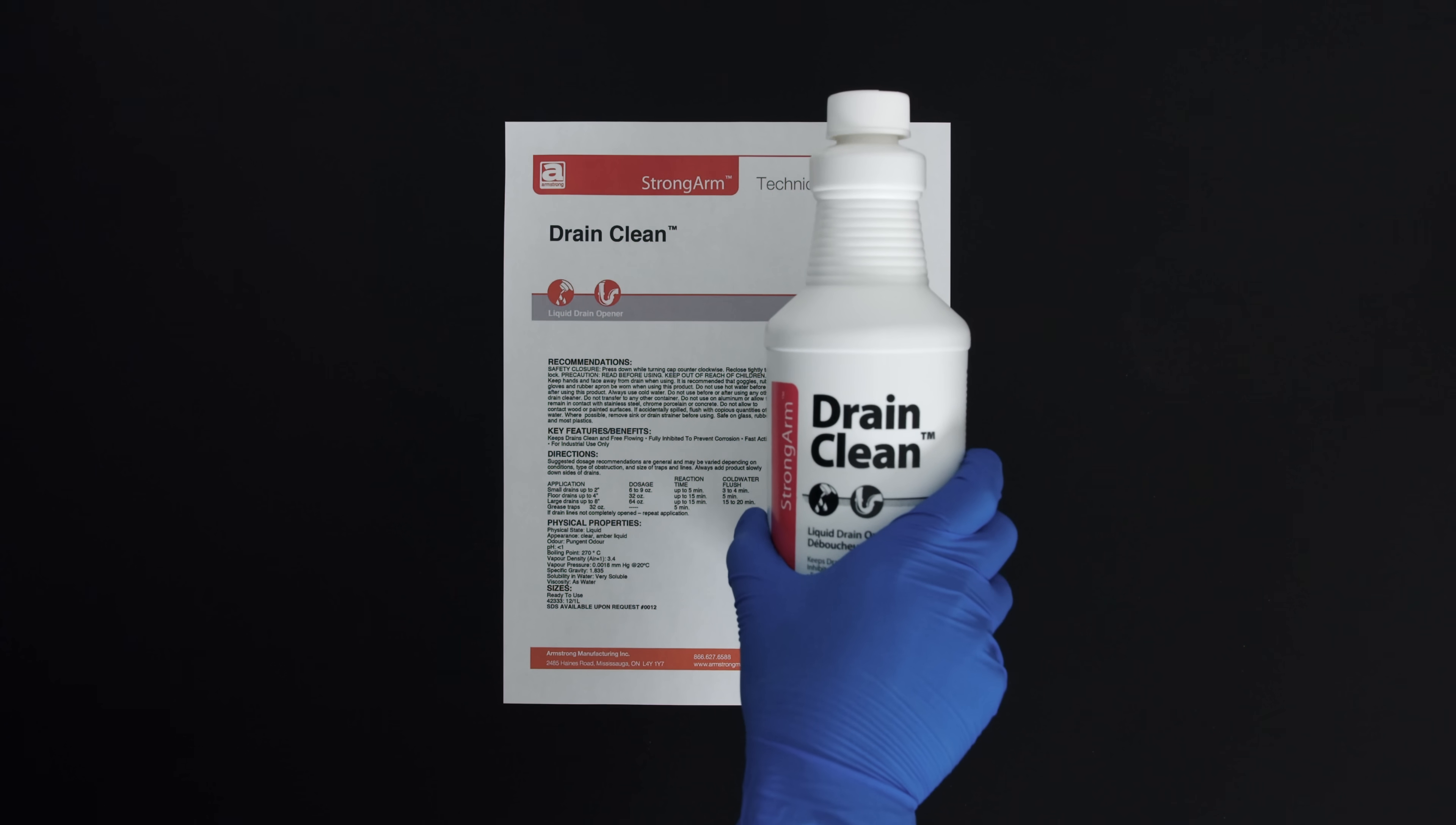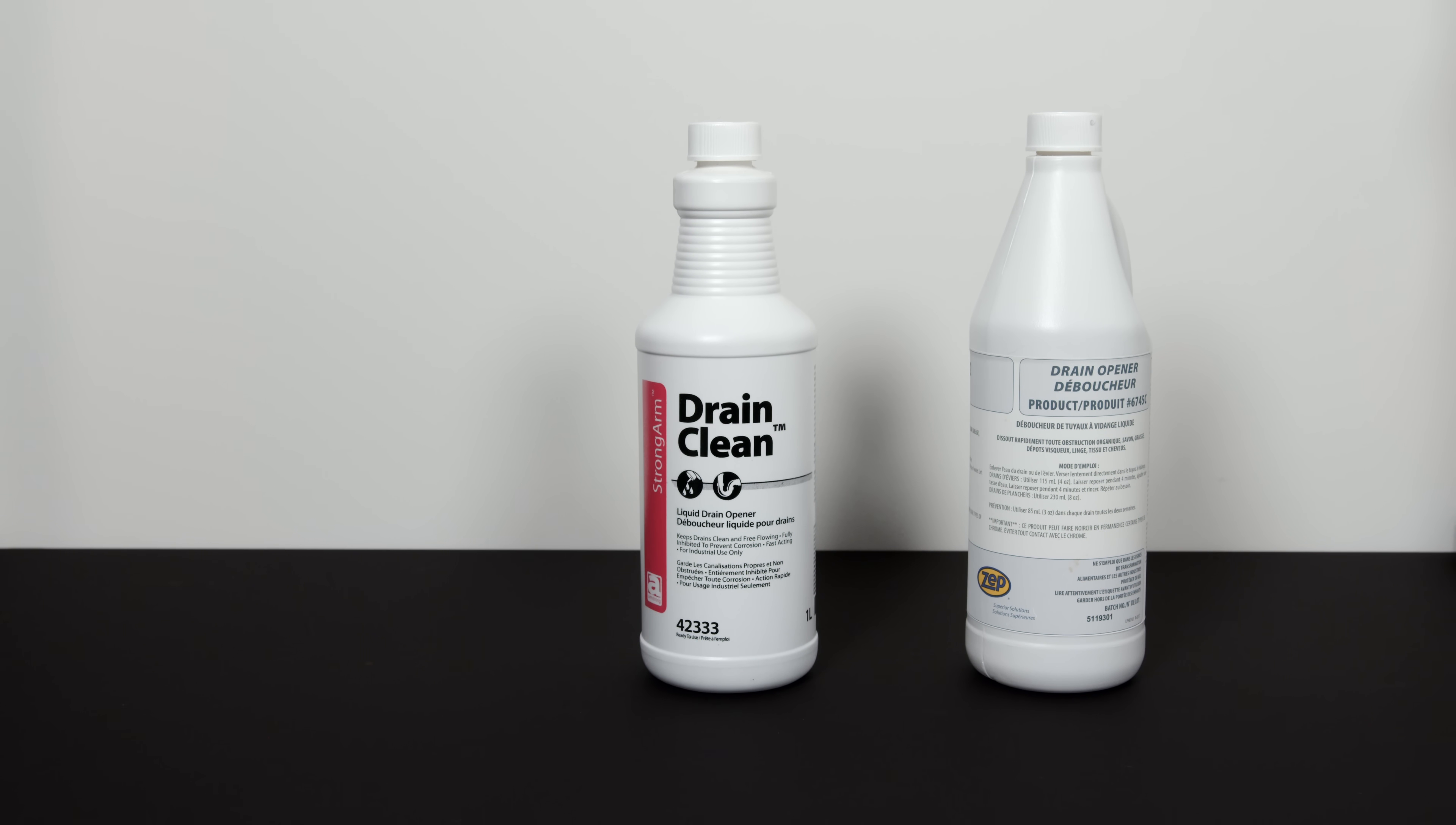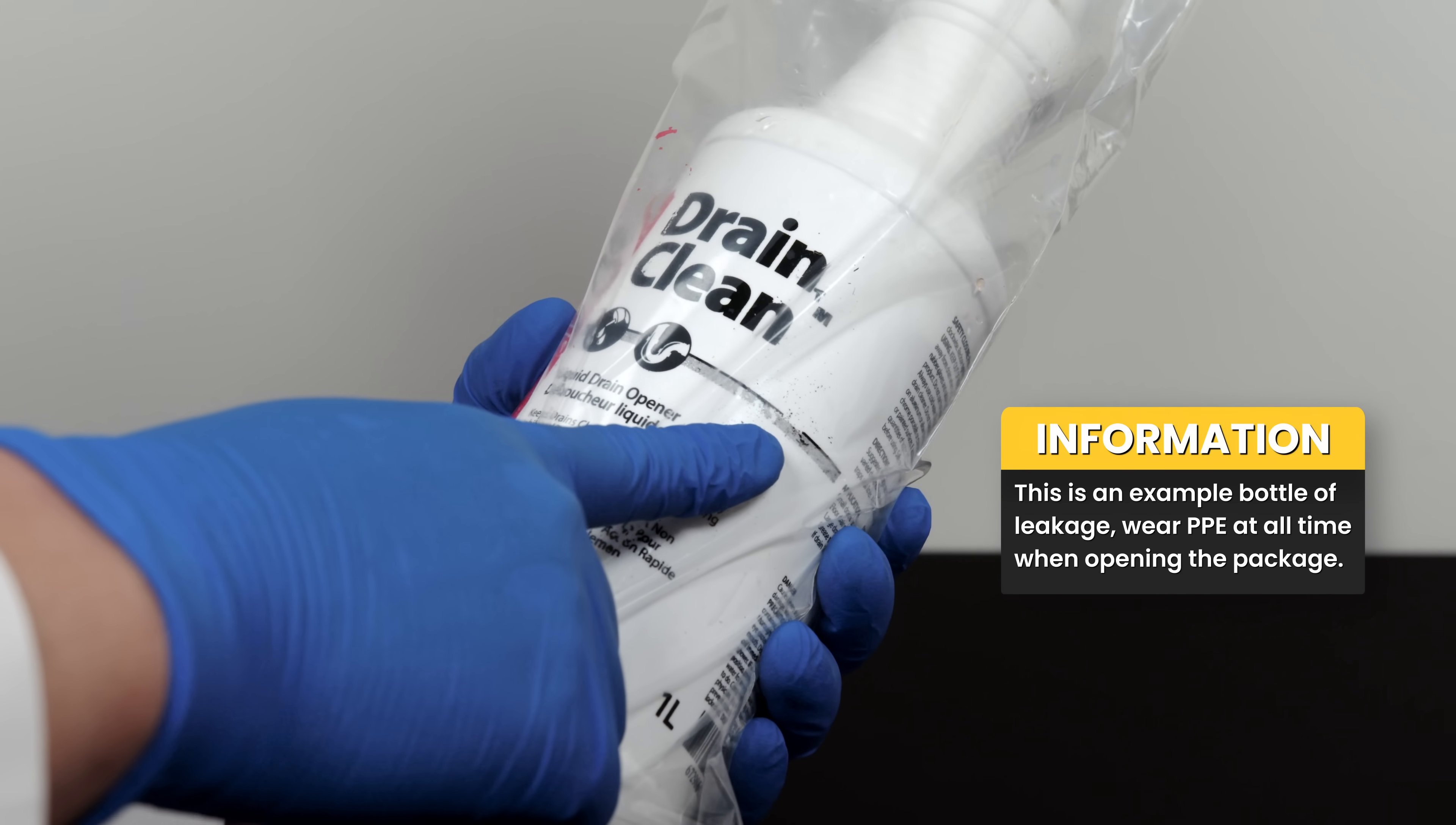It is rather tricky to identify which drain opener contains sulfuric acid. Though there are a few signs that will indicate it contains sulfuric acid. Firstly, they usually come in a 1 liter bottle in a shape like this. Trust me bro, I've tried a few brands and they all look the same. They will also come with a sealed plastic bag to prevent leakage.